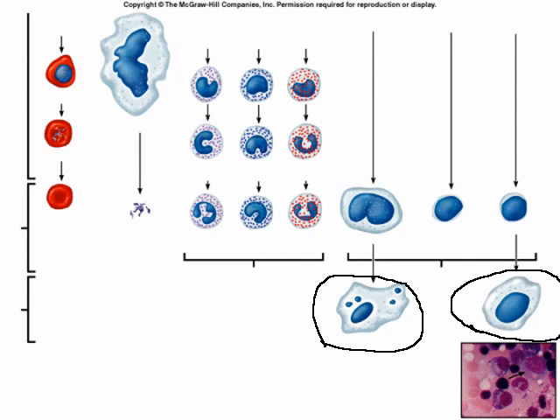The one on the left that I'll put an arrow on, you don't have to know this for this exercise, but this is just for information. This is a macrophage. You may have heard of macrophages. They're some of your body's major phagocytes. They come from monocytes that get out of the bloodstream and out into your tissues. And then this one on the right is a mast cell, and that, excuse me, I'm sorry, that is not a mast cell.